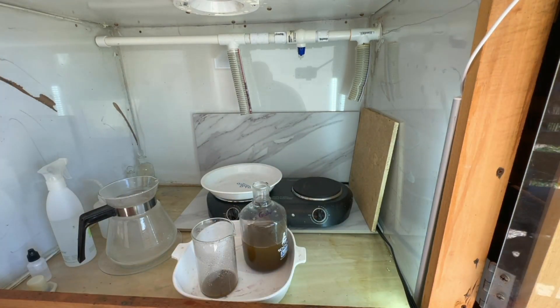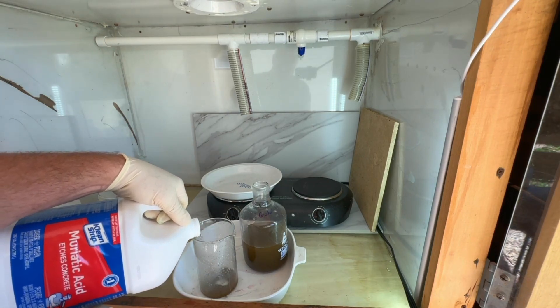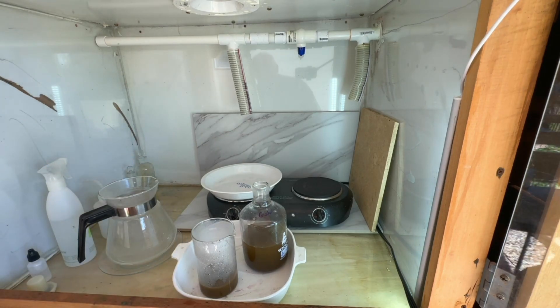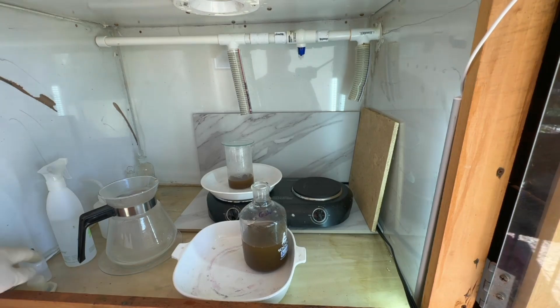At this point we'll do a hydrochloric acid boil — putting about 100 to 150 milliliters of hydrochloric acid in with the gold powder, setting it up on the heat, bringing it to a boil, letting it boil for five or ten minutes, then decanting off, washing again, and then we'll be ready for our second refine.